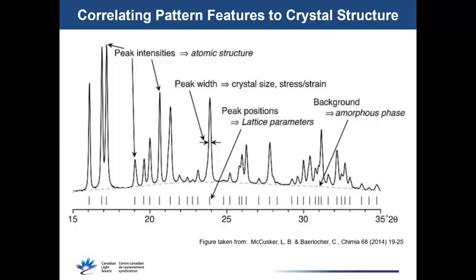These steps go in order, so before you can solve the structure, you have to figure out the unit cell and the space group. If you get that part wrong, again, you can spend an awful lot of time chasing down wrong answers. Generally, the thinner the peak width in your pattern, the easier it is to accurately determine both the positions and the intensities. So this is one reason why synchrotron is very useful for structure solution, getting high resolution data with as minimal peak overlap as possible.